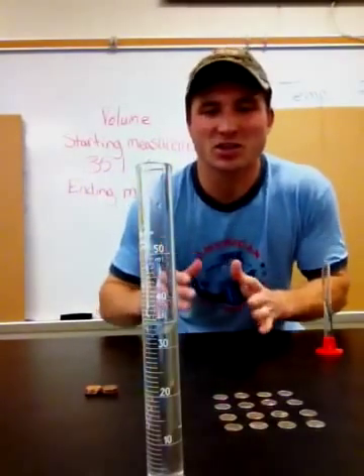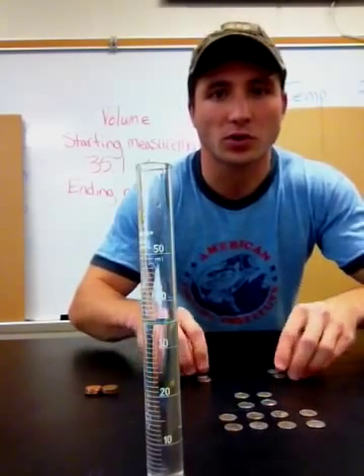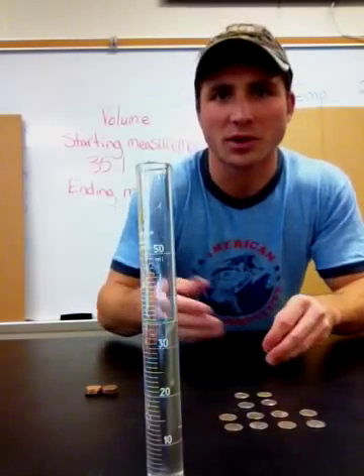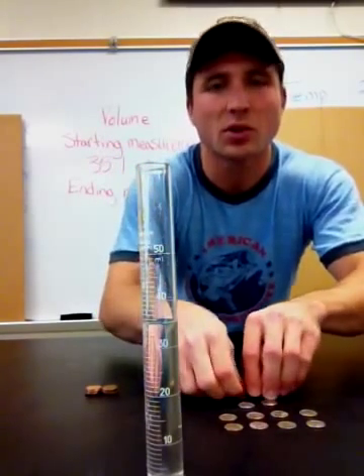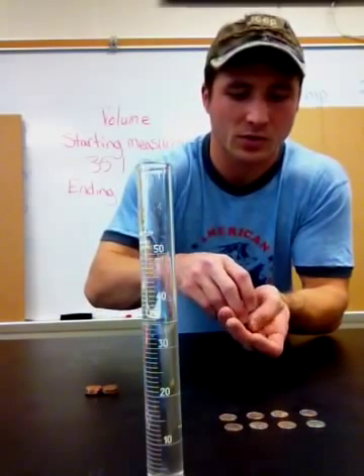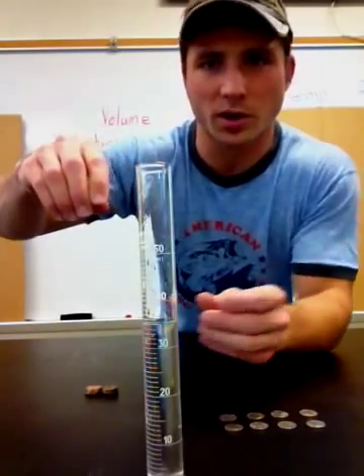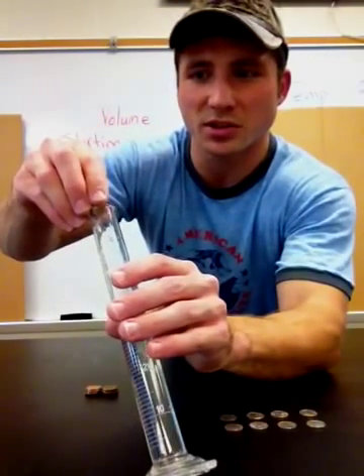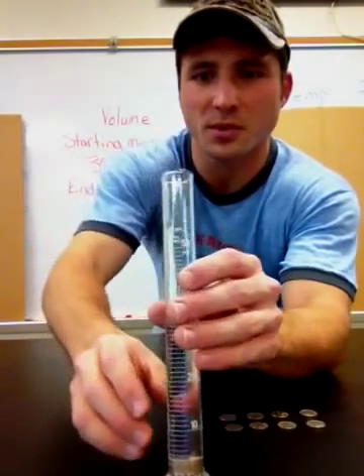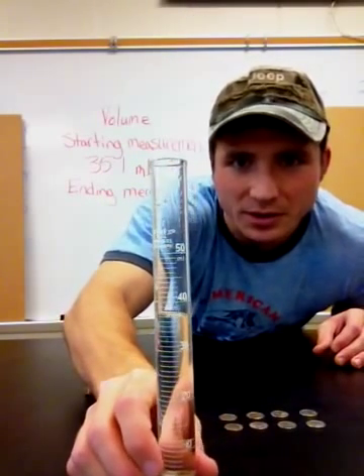Now we're ready to start our experiment. I'm going to add eight dimes and see how much the water level increases — the amount it increases will tell me the volume of my dimes. Here are my eight dimes. Try not to drop them where the water comes out, so you might have to tilt your graduated cylinder just slightly and slowly drop them in.